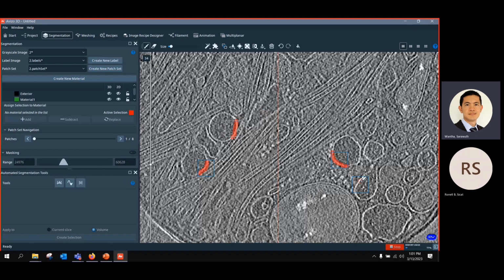It depends on your ground truth image. What I'm creating now is the ground truth, annotated manually. So you need to spend really good time, more time, on extracting good annotation of your ground truth. The more accurate your ground truth is, the better the result you have. You cannot expect to draw something really roughly and then get a good result from deep learning.